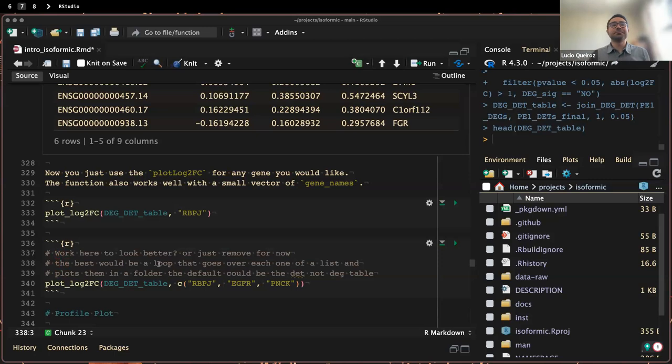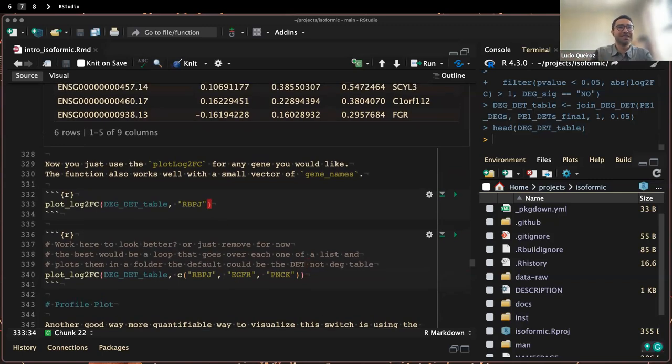Yeah. So now we are on the nicest part. Like at least for me, the best part of bioinformatics is plotting pretty figures. So we're in a nice part now. Remembering that actually here we are not really discussing any new statistical approach, any new computational method for this step. We are also showing how to interpret data that most of the time is already there. And like Wes did a great job saying that actually a lot of people are already using Salmon, Alevin-fry, that kind of thing. And that information is already there. And when you try to summarize that information, the transcript level expression back to gene, you are going one step back, not one step beyond. And you can have a much deeper biology if you go on that level.